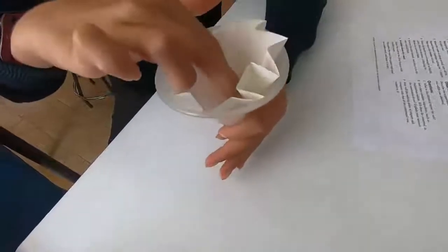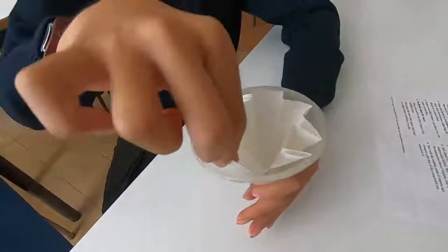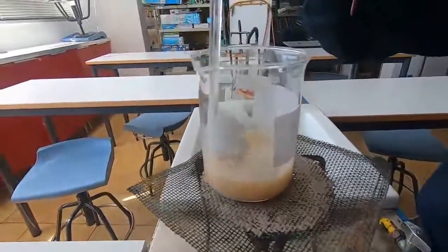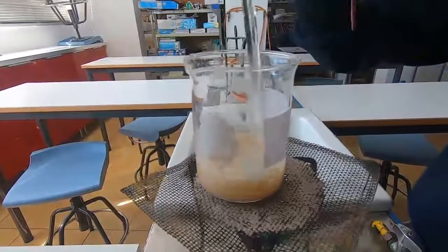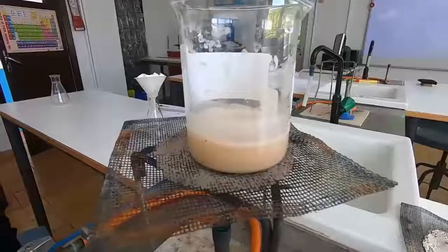That will fit nicely into our filter funnel. We just place it into a filter funnel and pour our solution in there — there will be a greater surface area doing the filtering. This has been warming up now and hopefully the salt has dissolved. We need to leave this to cool for a while before we actually filter.